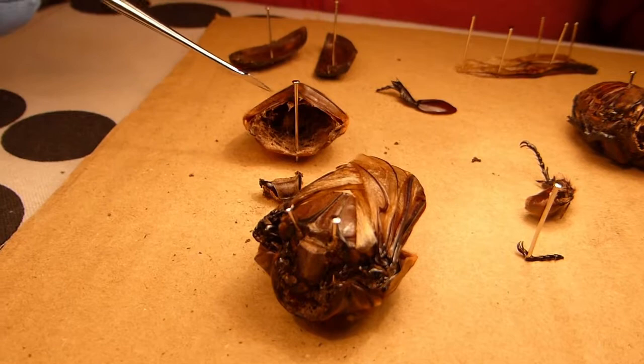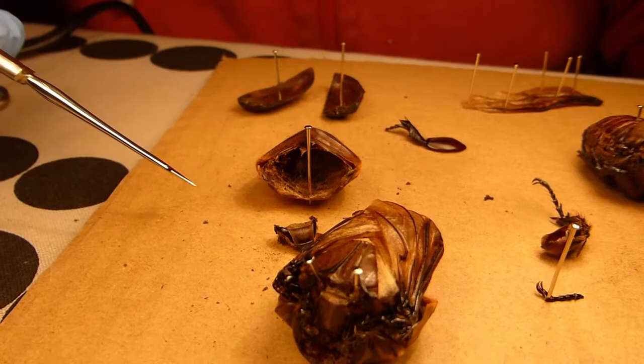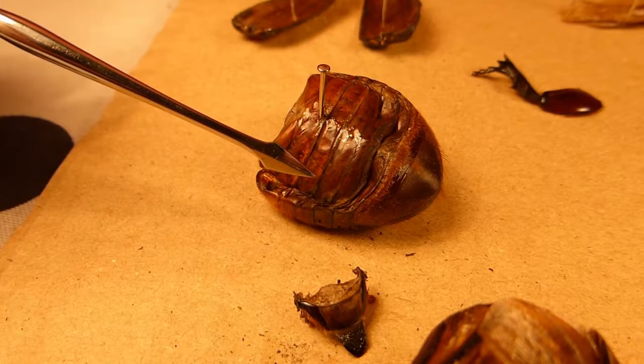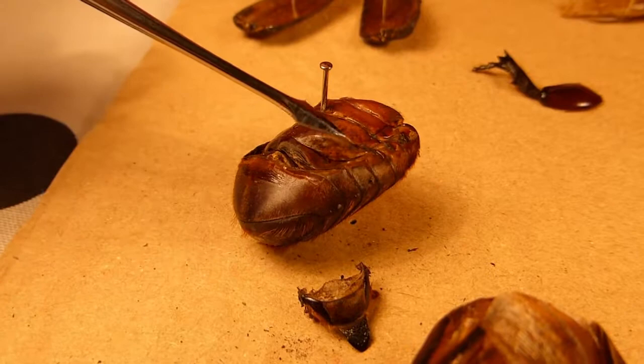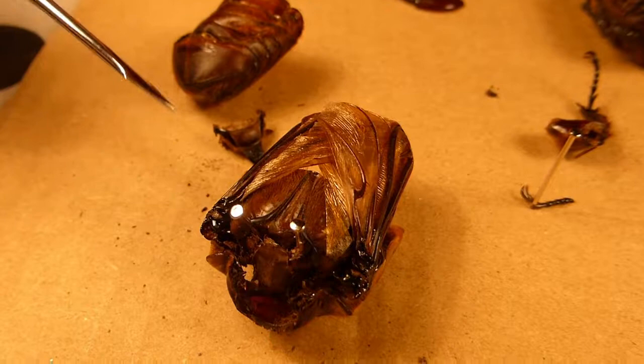You can see the interior — this would all have been full of haemolymph, this fluid that is analogous to mammalian blood. This hard chitinous exoskeleton is all that remains after the rest of the beetle has rotted away. You can also see here this is where the wings would have rested while the beetle was alive. And here you can see an excellent view of the spiracles, the breathing holes that lead into the tracheal system. So this is the midsection — the beetle's thorax.